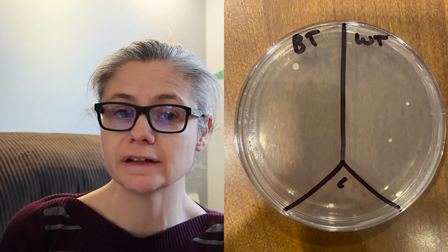Result for flushing with the lid down the second week. So near the vanity, we had one bacterial colony growing. Near the mirror, we had no bacteria growing. The wall with the toilet paper had about six small bacterial colonies growing on it, and the wall above the towel rack had nothing. Behind the toilet, we have one bacterial colony, and the wall next to the toilet had two bacterial colonies.